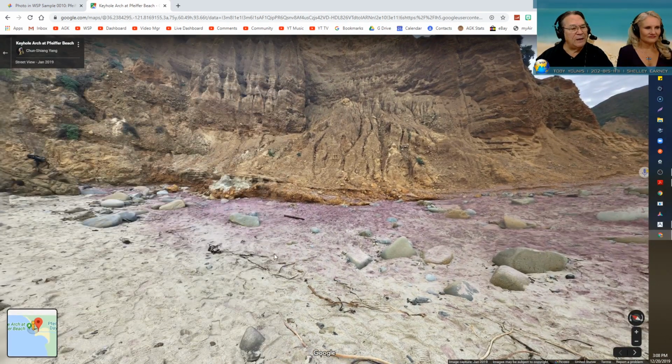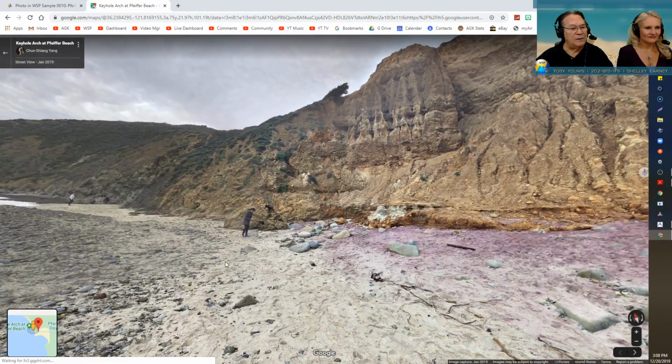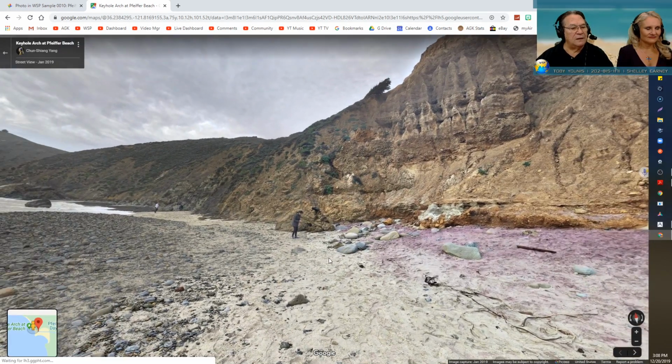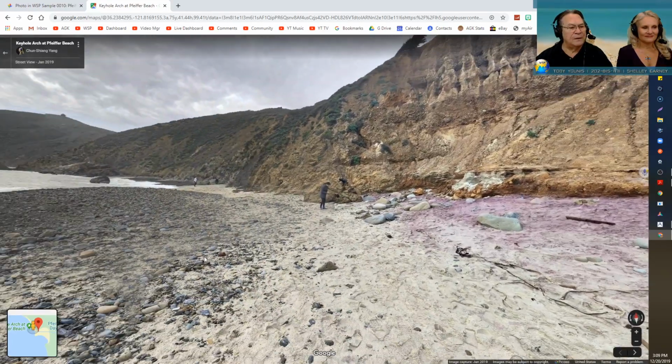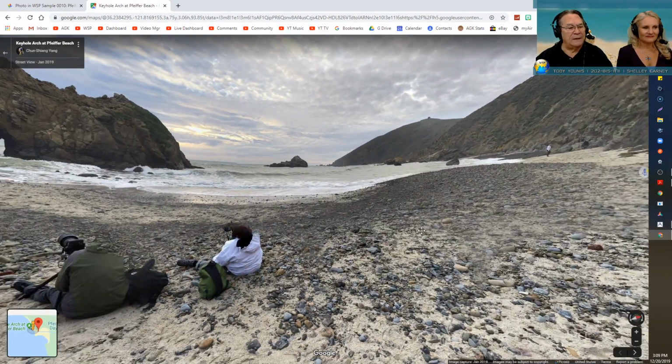And what's really funny about it is when I was making the sample, I put it in one of those little quartz jars. They separate from each other just naturally, so they must have different specific gravities, because when I tapped it to kind of level it out, the white moved over to one side and the red moved over to the other. You can see it in the images that I'm going to share. So that's what the beach looks like.